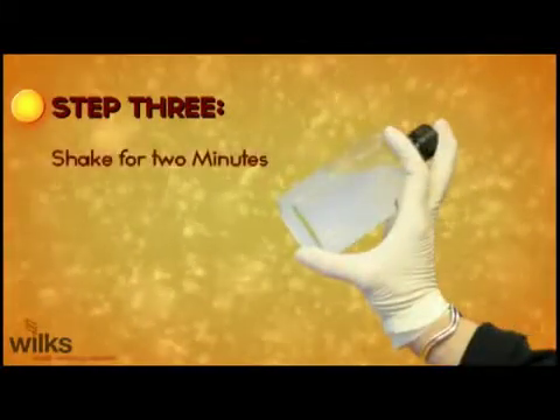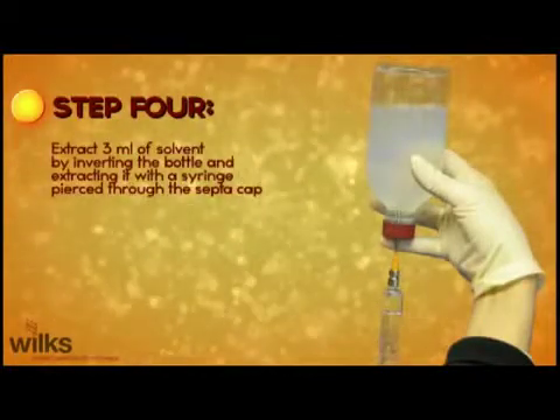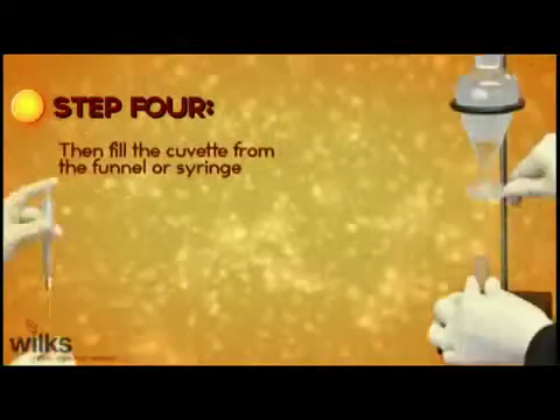Step 3: Shake for two minutes. Step 4: Extract three milliliters of solvent either by inverting the bottle and extracting it with a syringe pierced through the septa cap, or pour into a separatory funnel. Fill the cuvette from the funnel or syringe.